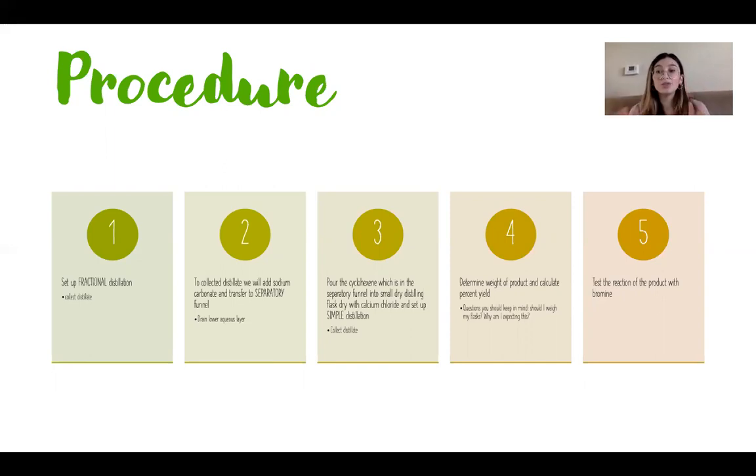So you guys need to know what the setup for both of them are. Afterwards, we're going to collect distillate from simple distillation. Then we're going to determine the weight of the product and calculate the percent yield. So some questions you guys have to keep in mind while doing this experiment.